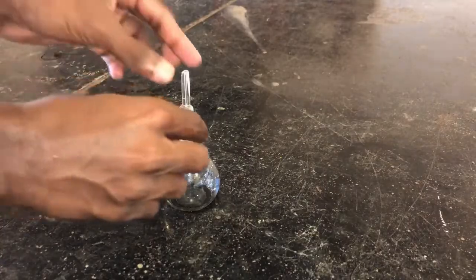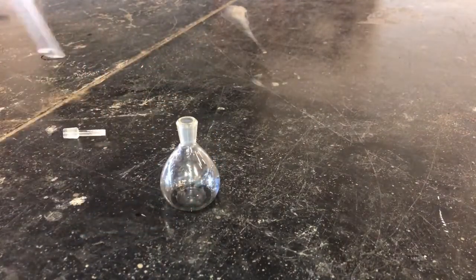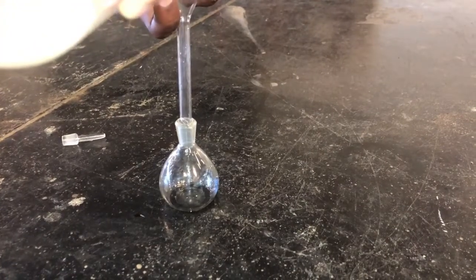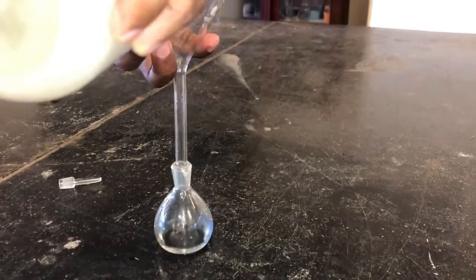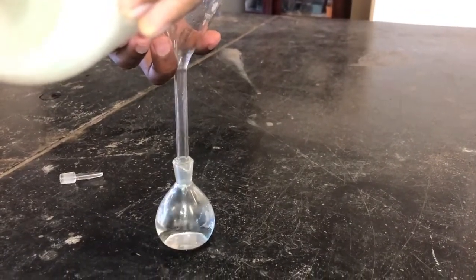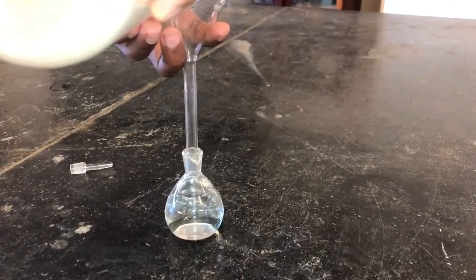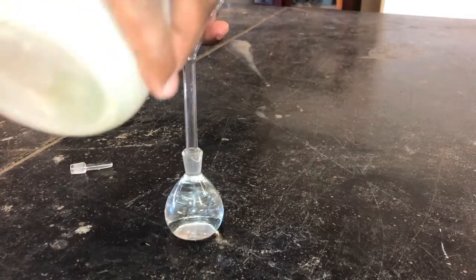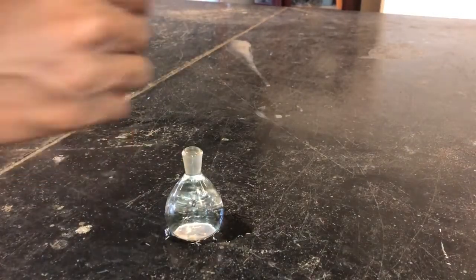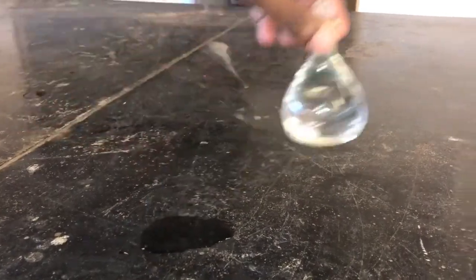After that, wash the bottle properly and fill it with distilled water. Fill it completely and close it with a stopper. After that, take the new weight.